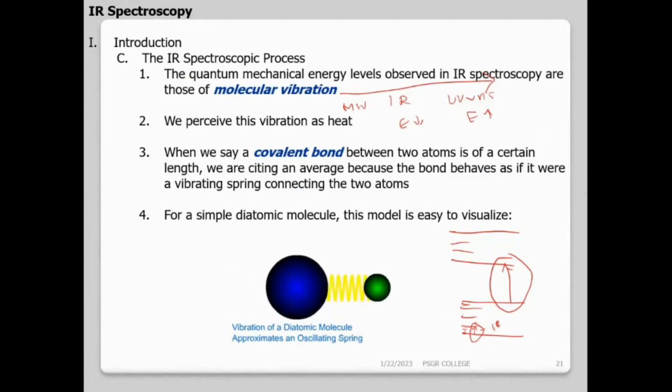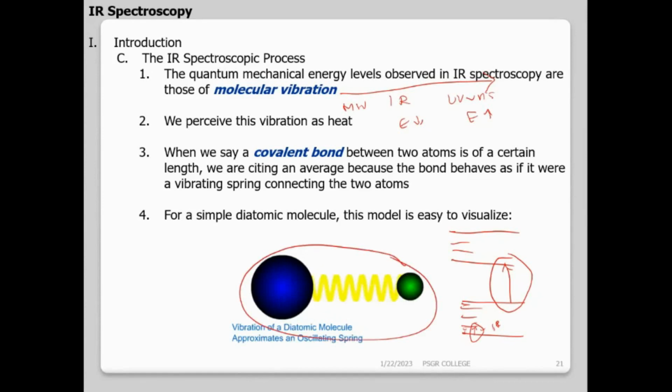Now when I see a molecule, these molecules are made up of bonds. I'll be having covalent bonds, ionic bonds, whatever. They'll have different bond lengths, and generally the bond length is an average bond length, because every atom in the molecule is attached to a bond. They behave like a spring. Why a spring? Because the molecules are oscillating like a spring. The animation given here shows an oscillating spring. The molecules are vibrating, expanding and compressing. Expansion and compression both keep happening. Okay, this is how you should visualize the diatomic molecule.